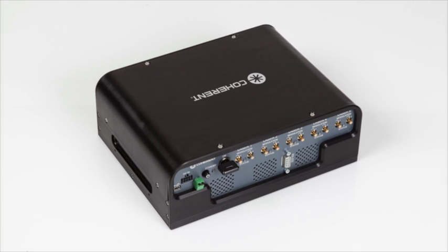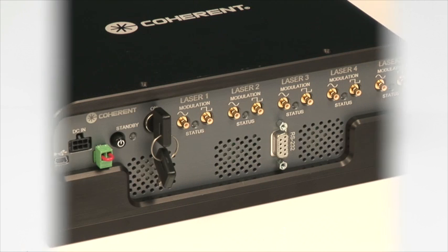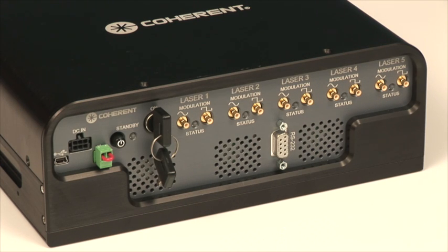Hello, my name is Dan Callan from Coherent and today we'll be looking at the OBIS laser box, which holds five OBIS lasers for thermal management and full features and control. The Coherent laser box for OBIS lasers helps to hold five OBIS lasers and complete the thermal management and interface I/O.